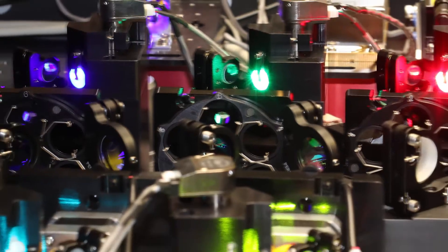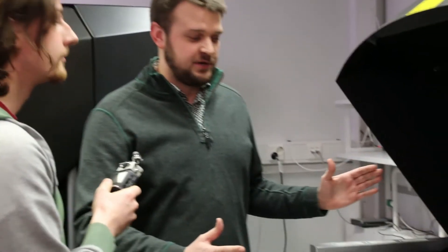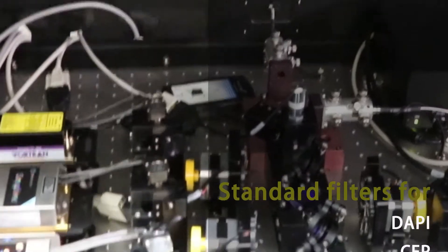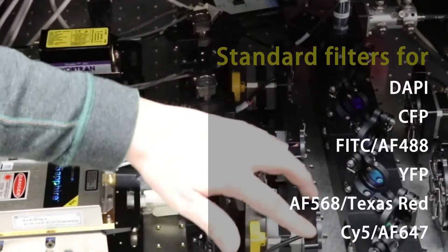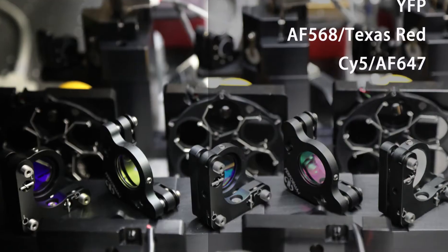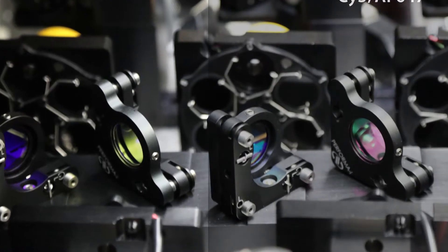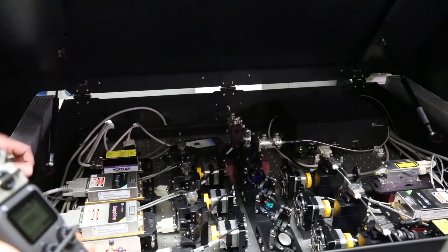This is kind of all the electronics that make everything work, control everything, and provide the light. Underneath the hood here are the six lasers — they're all visible light lasers across the visible spectrum. Each of the six laser lines has its own high-speed shutter, after which it goes through an ND filter wheel, which can change to allow different power transmission for each laser. It then goes into the beam combiner block, which sends it down the fiber optic.